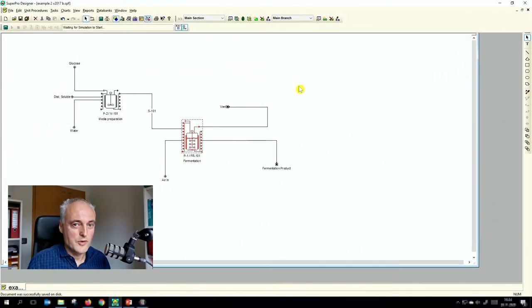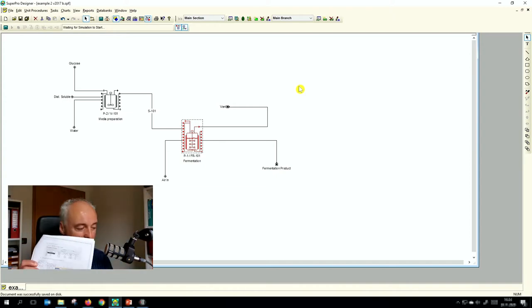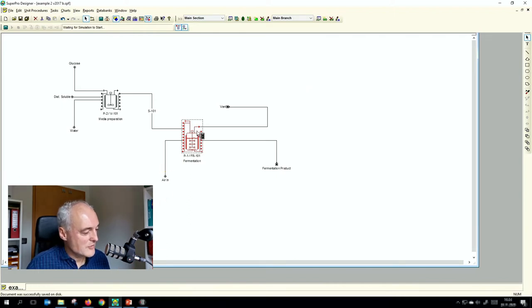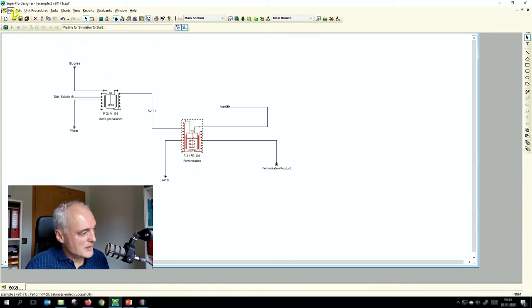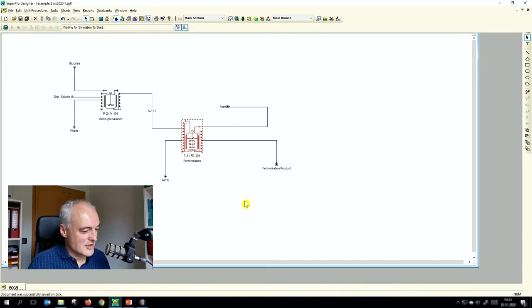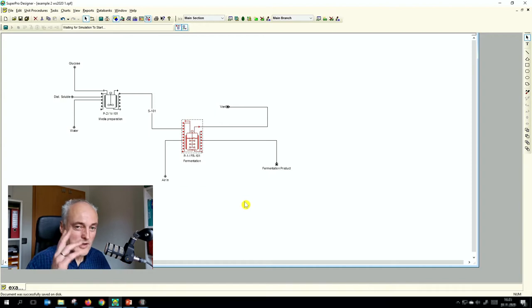Going back to the chart — what we have is our bioreactor, our media preparation, and if we do the mass balance everything should be fine. Saving is always a good idea.